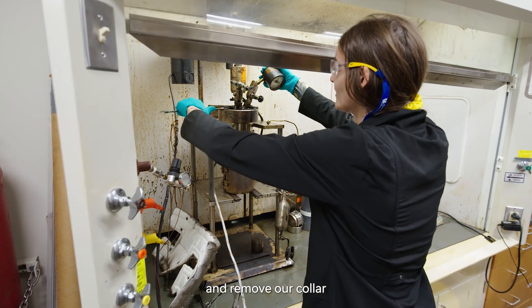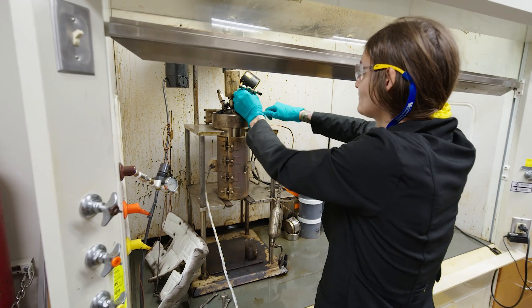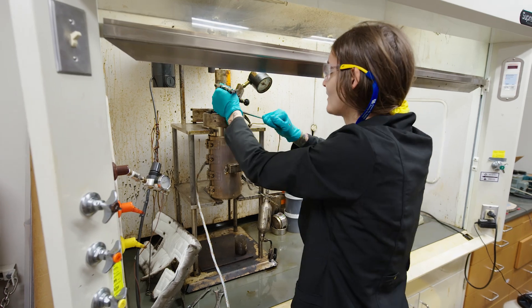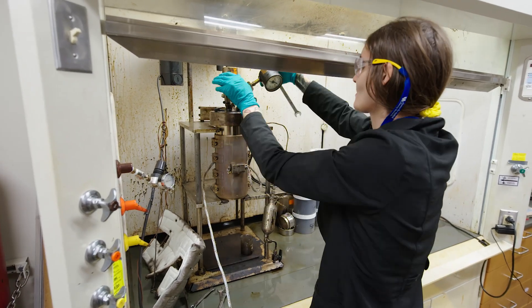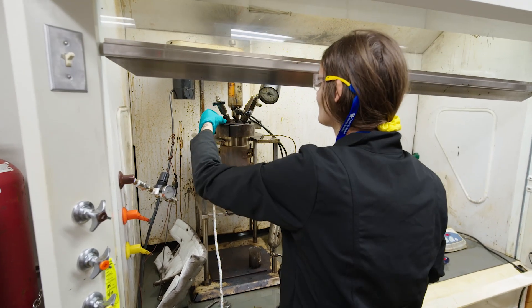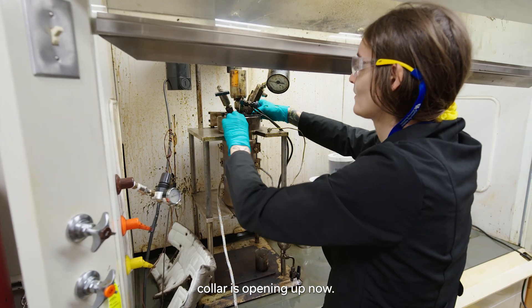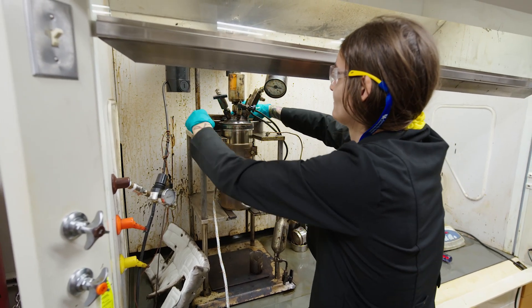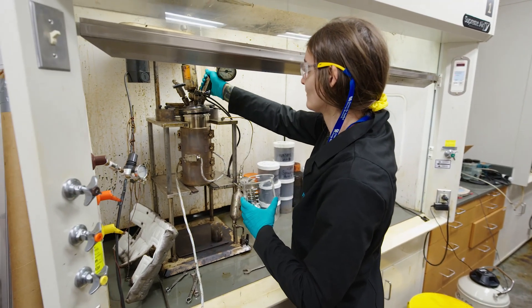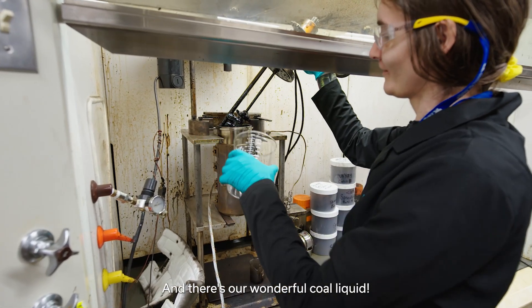Remove our thermocouple, remove the insulating jacket, and remove our collar. You can tell I'm not the one that tightened this. You can see that collar is opening up now. And there's our wonderful coal liquid.